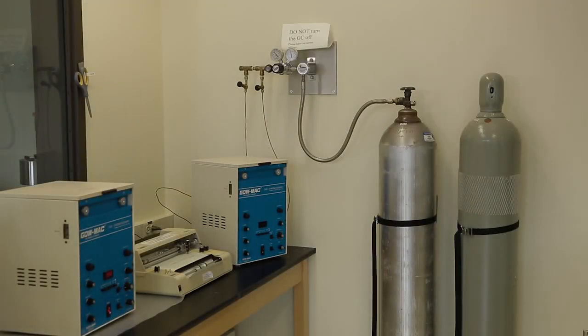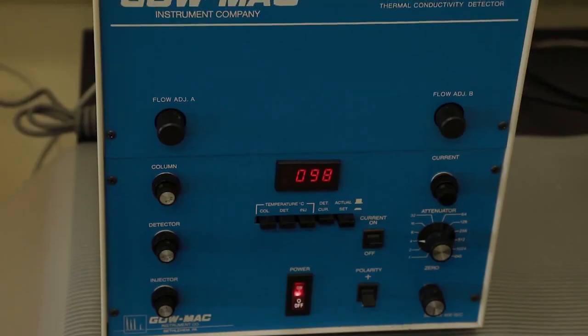To perform gas chromatography, often called GC, we use a gas chromatograph.